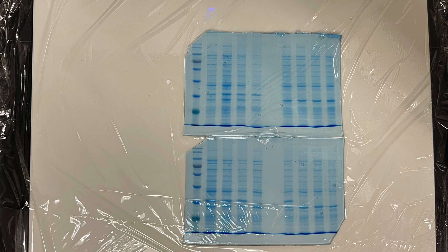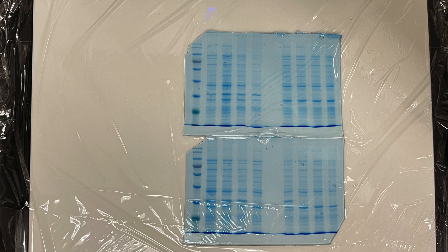And so as you see, this process is so much more involved than an agarose gel. It's much more time consuming. Even something like colorizing and then decolorizing, it just takes so much longer. But it's a wonderful thing to look at. All these little blue bands that you see are the proteins that the Coomassie has stuck to. Lane 1 on the left is our protein standard ladder. It actually comes pre-dyed, but it does pick up the Coomassie blue dye. And then look at the notches. Top left for gel 1, which is on the top, and then gel 2, top left, bottom right. This allows me to orient.